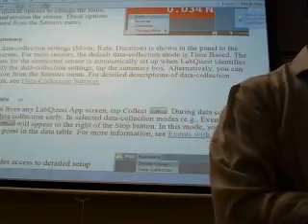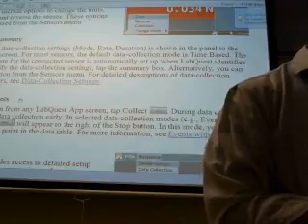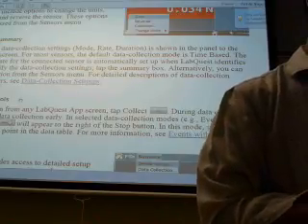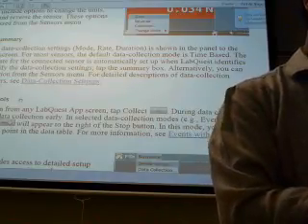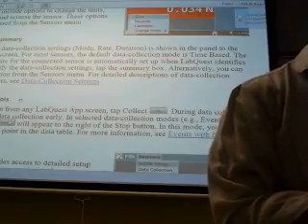So I'm going to sample every 1 second. Oh, so we have to change the interval, right? Yeah, and the duration, I'm going to just collect maybe 10 seconds because I don't want to wait around too long.